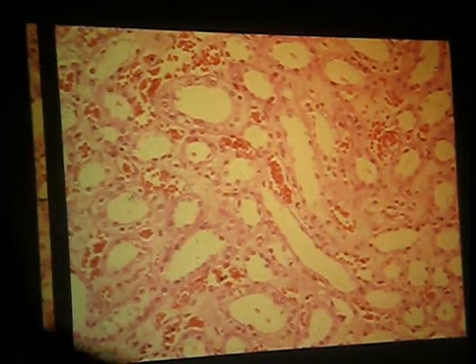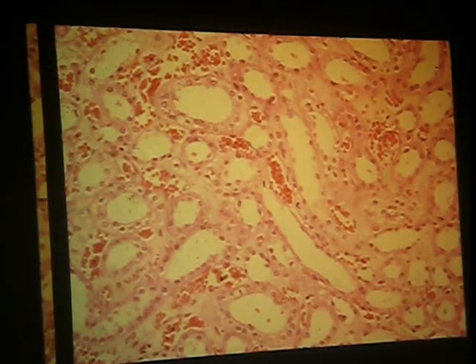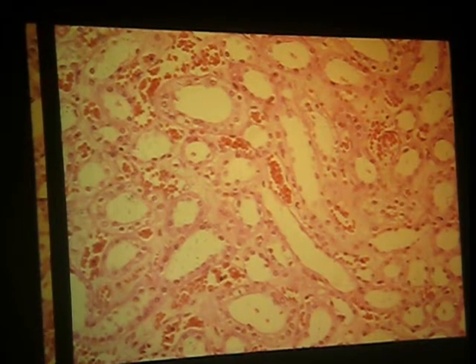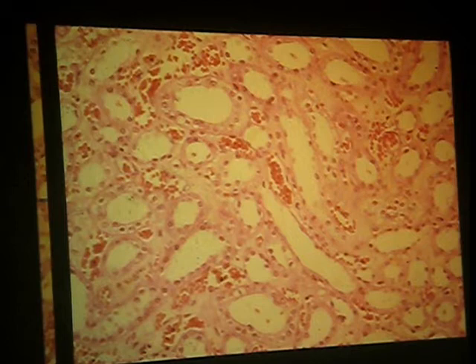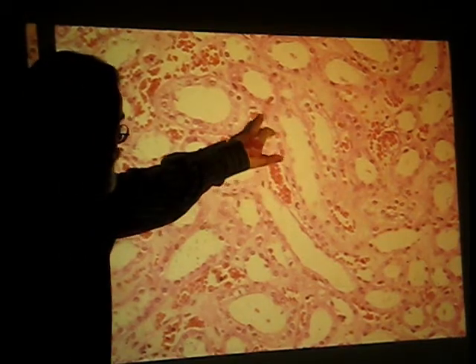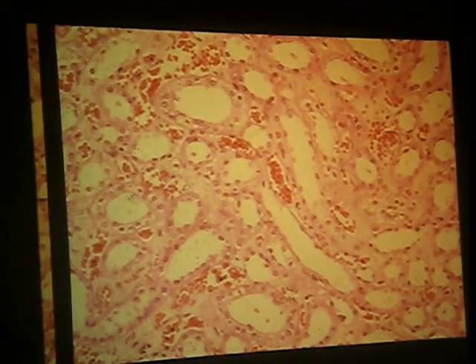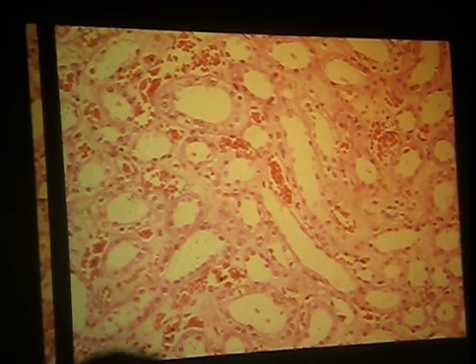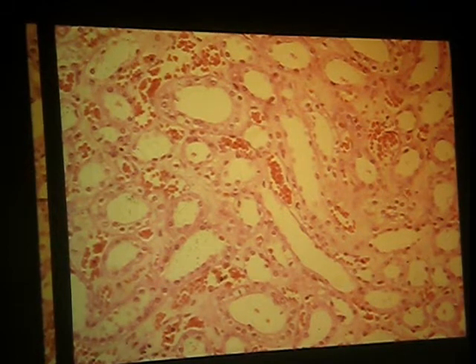Okay. We're in the medulla, right? No corpuscles. Remember that the fence, if you will, the arcuate vessels, arteries and veins, define that interface between cortex and medulla. So, what are these blood vessels? Exactly, vasa recta. They start out as arterioles, and then they can branch into a capillary network, which then drains into a venular network that runs opposite, adjacent, to maintain that border.